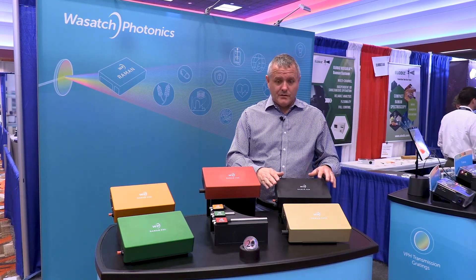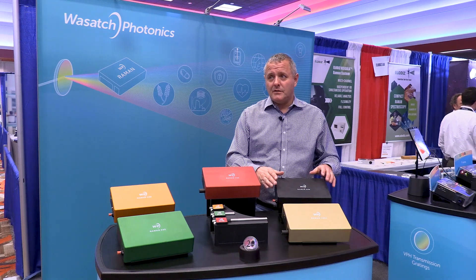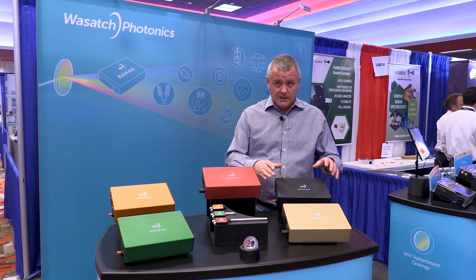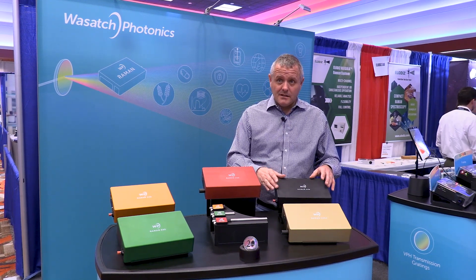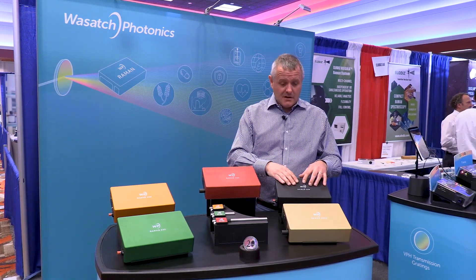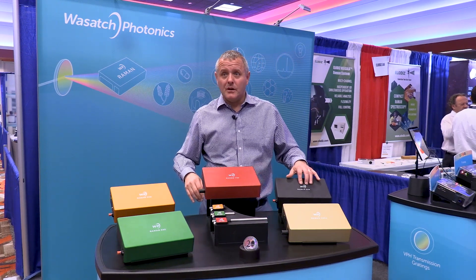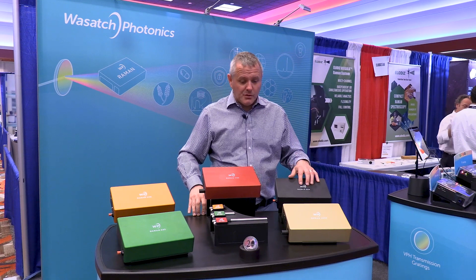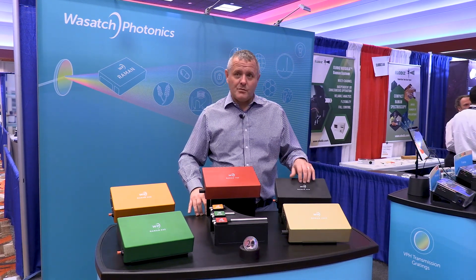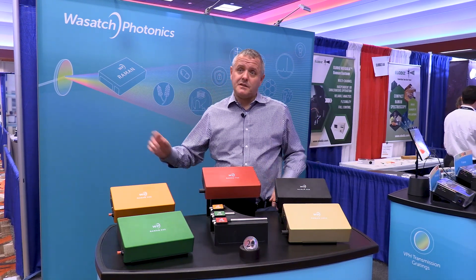To start off with, the researcher, lab, or industrial company gets the benefit of a fully CE-marked, fully FDA-approved turnkey instrument, so they can start using it safely and compliantly. But because it's got an OEM inside, the data they take carries them all the way through the process. Whatever model you build, whatever principal component analysis or library you build on day one, the spectrometer takes you on that journey — from first idea all the way to commercialization.